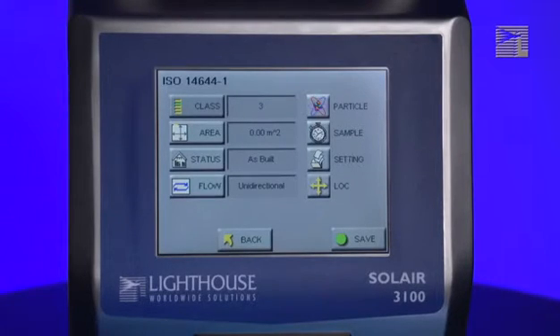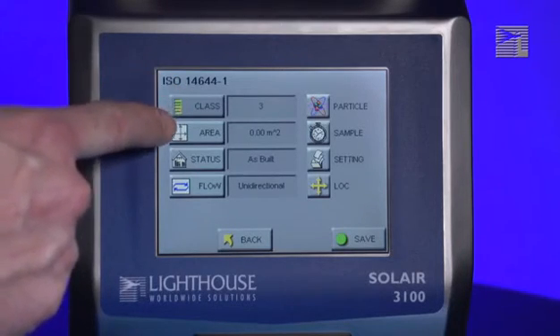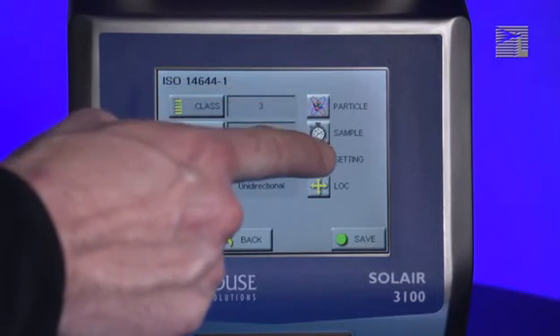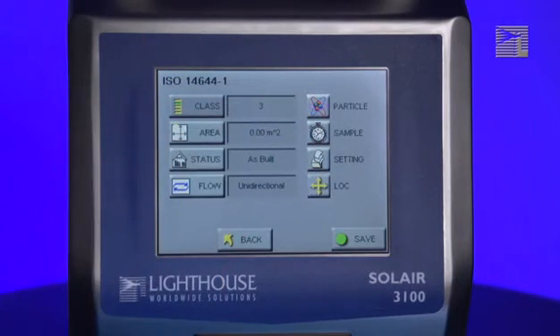For the ISO 14644-1 report, the setup parameters are: Class, Area, Status, Flow, Particle, Sample, Setting, and Location.